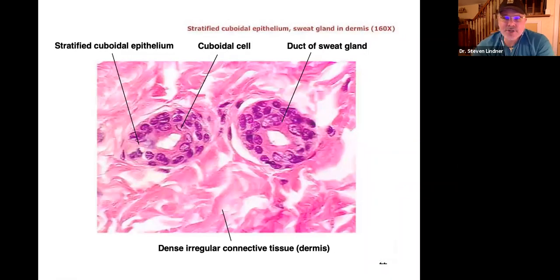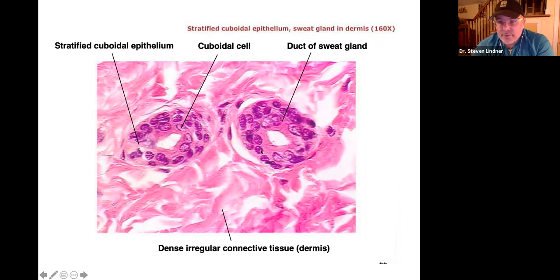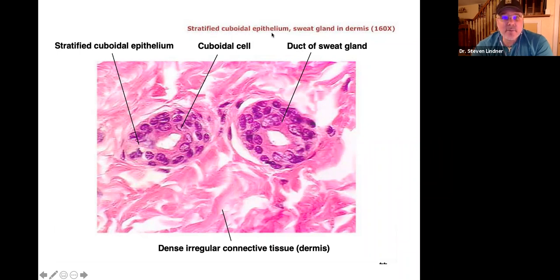Now shifting gears — here's a lumen, and another lumen. What surrounds them? They look like round cubes, but it's not one cell layer — this one looks like two to three layers thick. So we're going to call that stratified cuboidal epithelium.